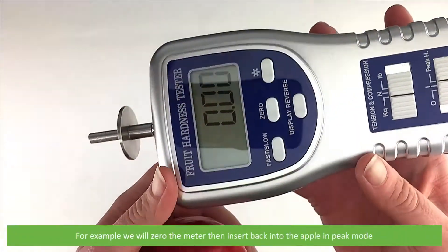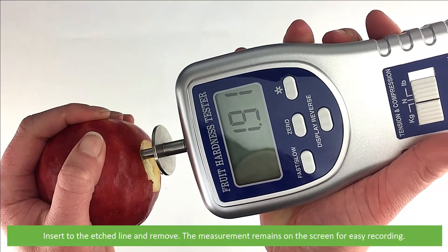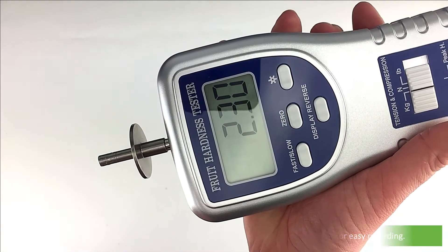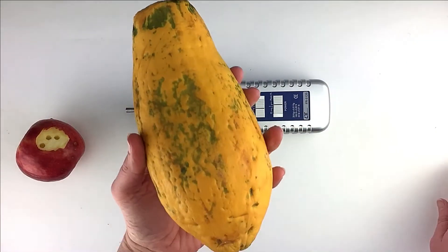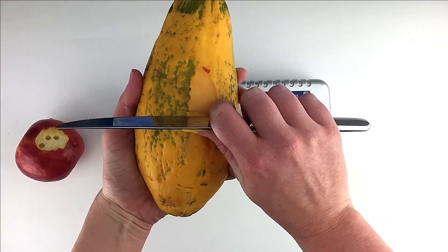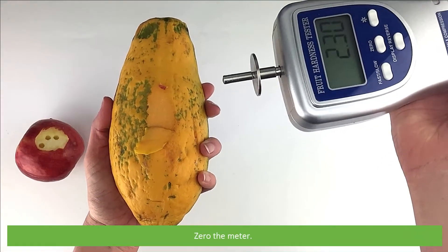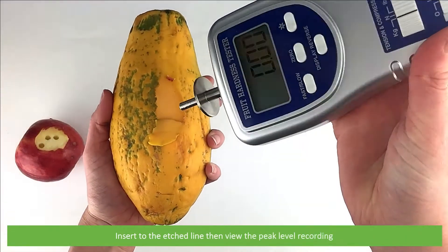For example, we will zero the meter then insert back into the apple in peak mode — insert to the etched line and remove. The measurement remains on the screen for easy recording. Repeat the same with another sample in peak mode: zero the meter, insert to the etched line, then view the peak level recording.